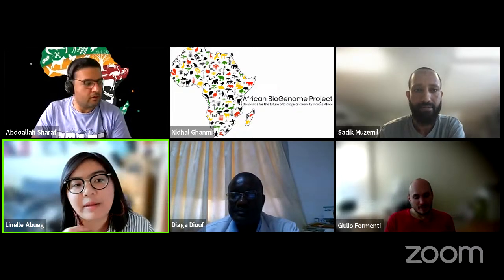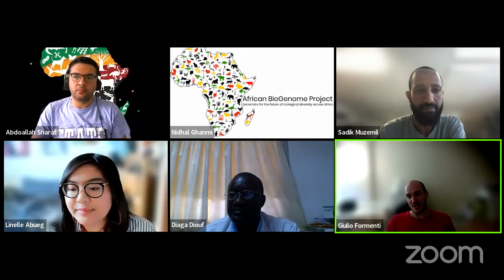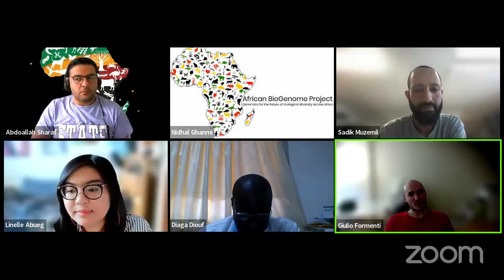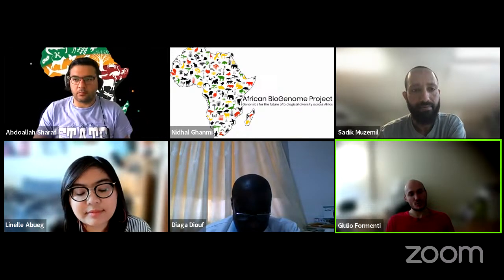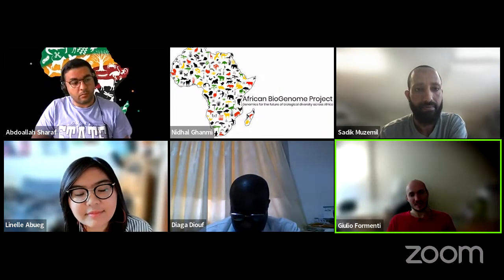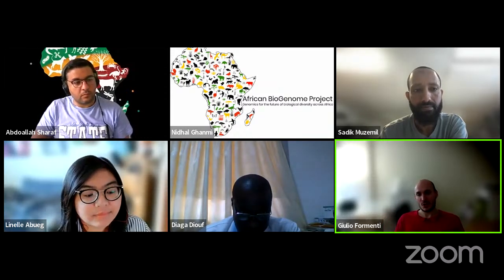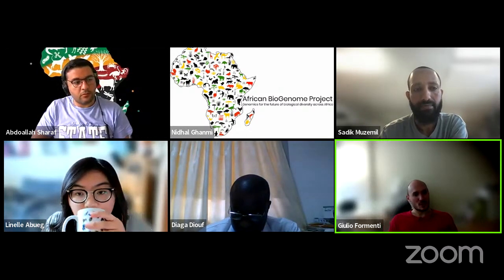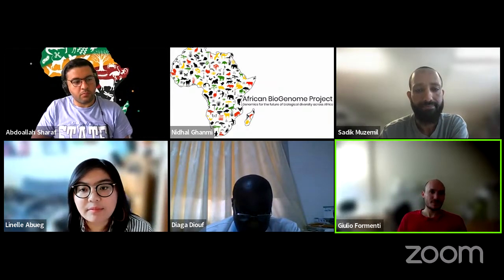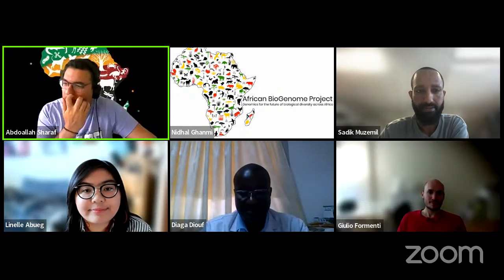I don't know if Giulio wants to chime in. Maybe I can complement that, just to say that at the end of the day, it all comes down to evaluation. So there is no recipe that necessarily will work out of the box on a new genome. What you really want to do is look at the results from QC, particularly all these spectra k-mer plots that we showed, and if they look suspicious, then that's where you should stop and try fine tuning. Okay, so I hope this really answers your question.